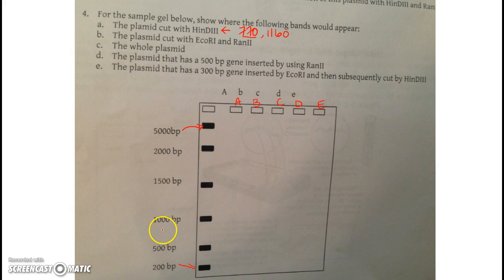And so it's got to be bigger than 500 but smaller than 1,000, so I'm guessing it's going to be somewhere pretty close to the middle there. All right, so we're going to get a band there. 1160, that's more than 1,000, but not 1,500, so it's going to look somewhere like that. So that's what would show up in the gel if we cut it all with HindIII.